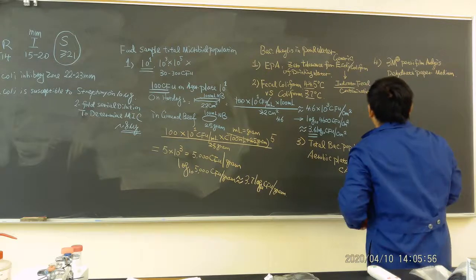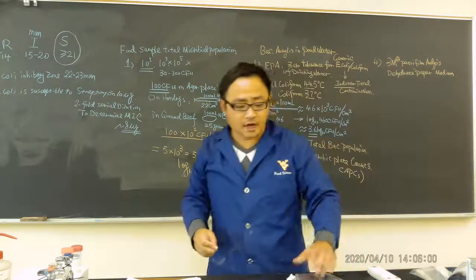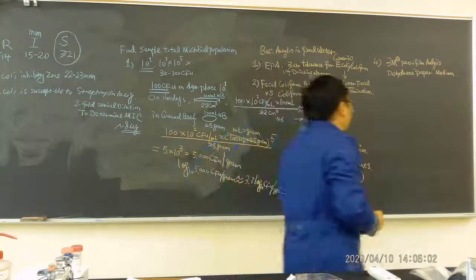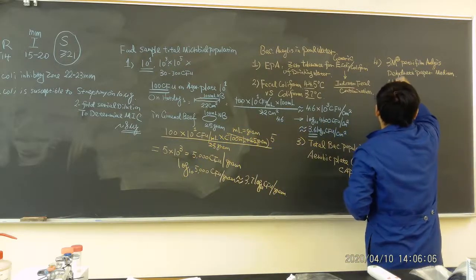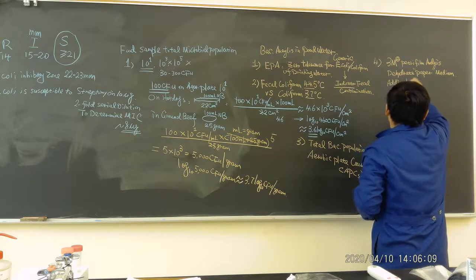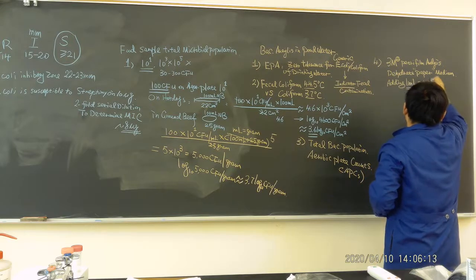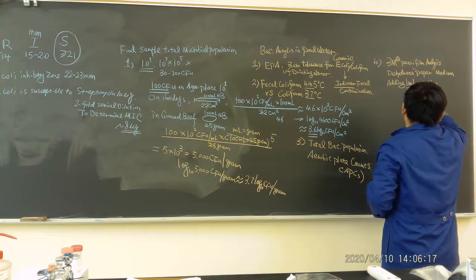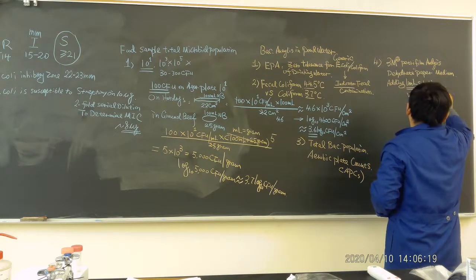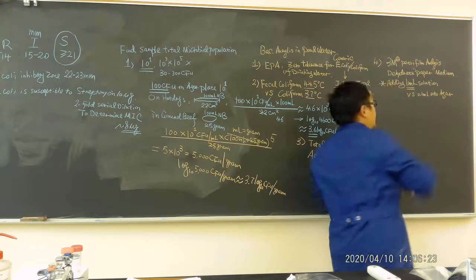Okay, now I want to mention the major difference between these and agar plates. With all these paper media, we add 1 ml solution versus 0.1 ml onto the agar. This is a major difference you should know.